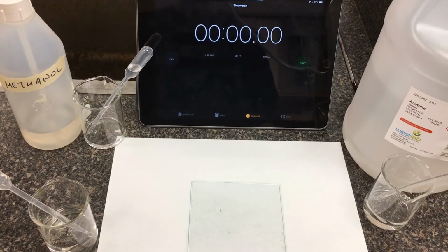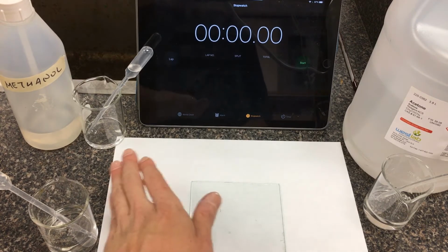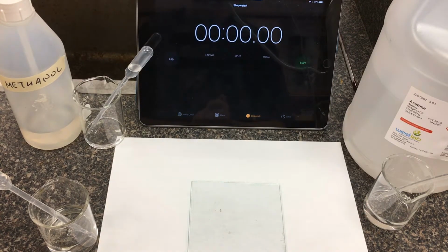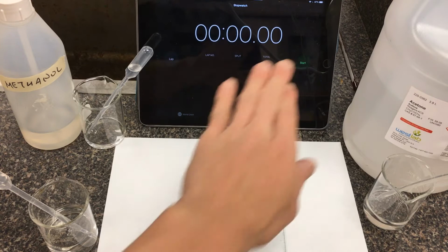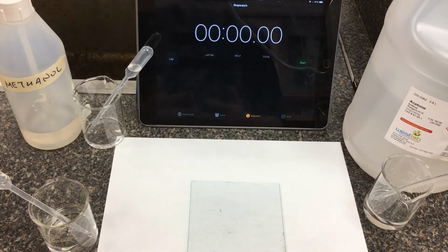Okay, so this is part one of our volatility lab. We're going to be comparing three different solutions: tap water, methanol, and acetone. In this portion of the lab, we're going to use these droppers here. We're going to drop a droplet or two on this glass plate, start the stopwatch, and just qualitatively compare which one seems to evaporate more quickly or less quickly as a measure of the intermolecular forces.